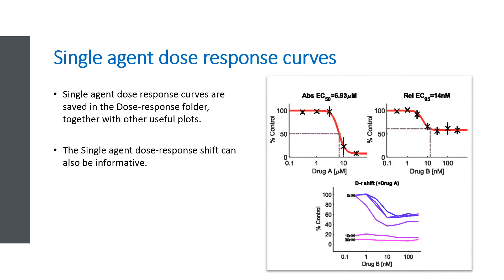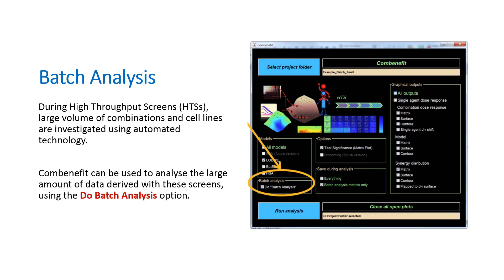Single-agent dose response curves are saved in the Dose Response folder, together with other useful plots. The single-agent dose response shift can also be informative. During high-throughput screens, large volumes of combinations and cell lines are investigated using automated technology. ComBenefit can be used to analyze the large amount of data derived with these screens, using the Do Batch Analysis option.